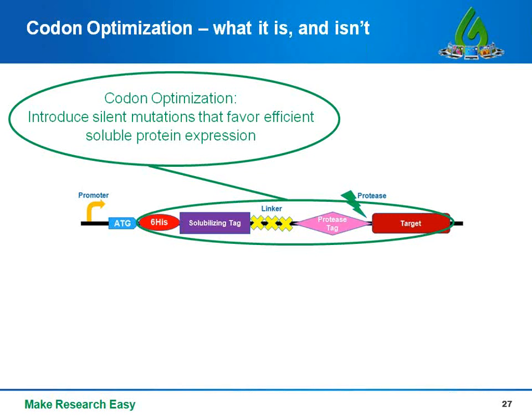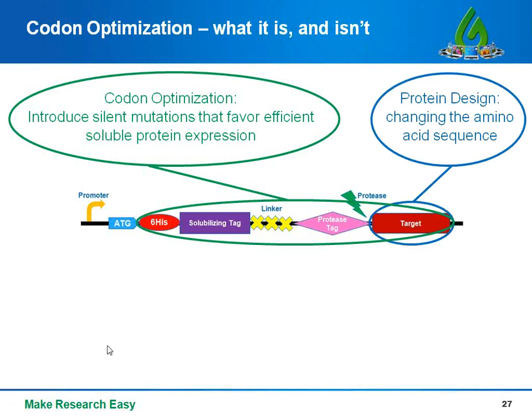As we saw in one of the case studies, codon optimization of their P2A linker and their NLS tag really made a difference in expressing the entire construct. So it may be worthwhile to synthesize codon-optimized sequences for your tags rather than simply using the tags that come pre-made in commercial vectors. Again, codon optimization does not change the amino acid sequence.